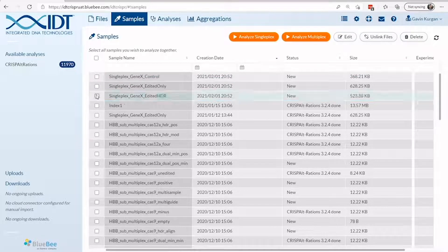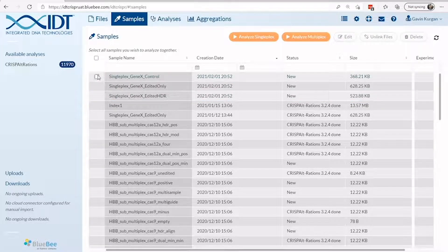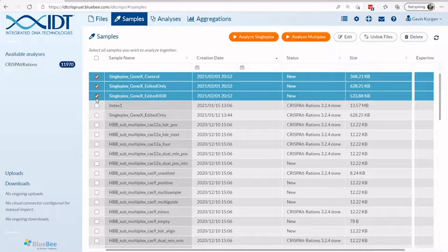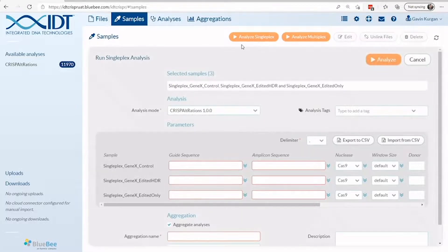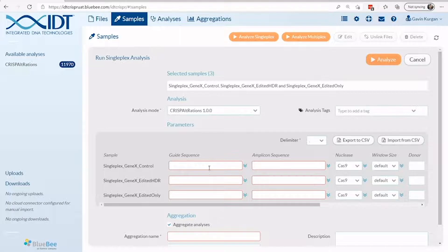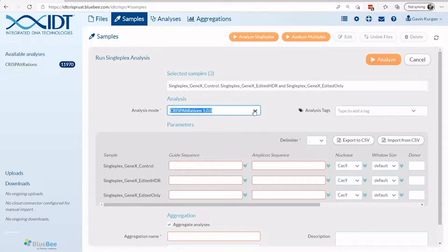From here, you can see all samples that have FastQ files associated with them. Select the group of samples with a single amplicon that you want to analyze. Click Analyze Singleplex. From here, you can associate information and parameters with your run and individual samples, and select the version of CRISPR alteration software to use for analysis.